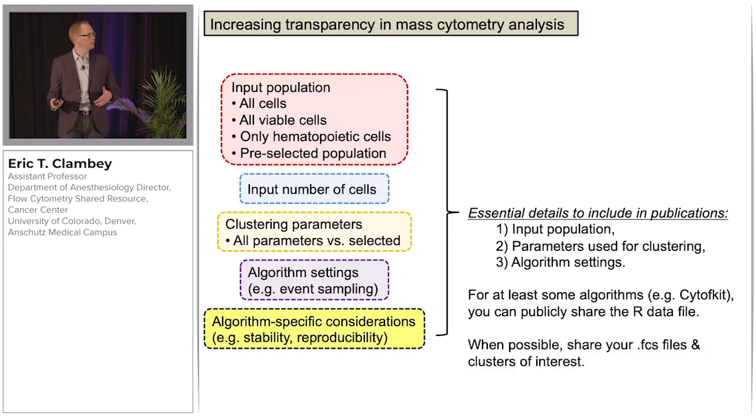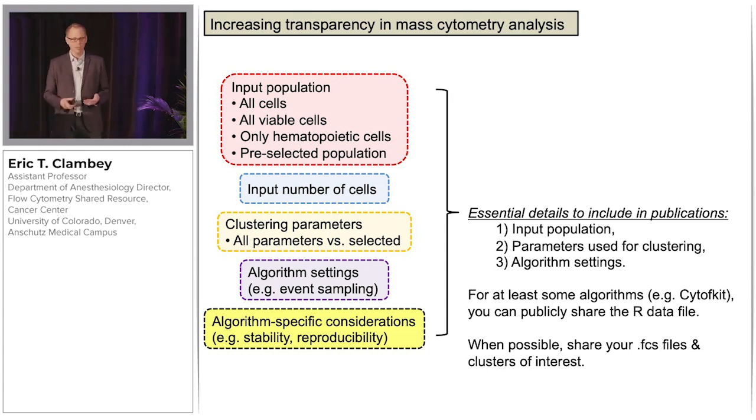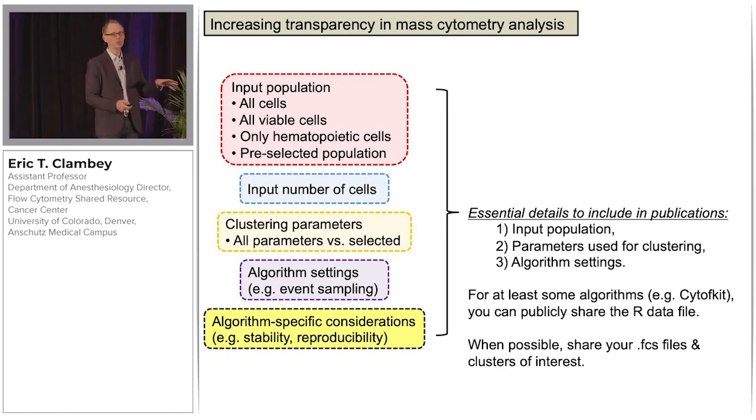I would also challenge the field to increase transparency in your CyTOF data analysis. I think if you're publishing CyTOF data, you absolutely need to include your input population, the parameters used for clustering, the algorithm settings. For at least some algorithms, such as CyTOFKit, you can publicly share the R data file. But I would strongly urge sharing FCS files and clusters of interest whenever possible.